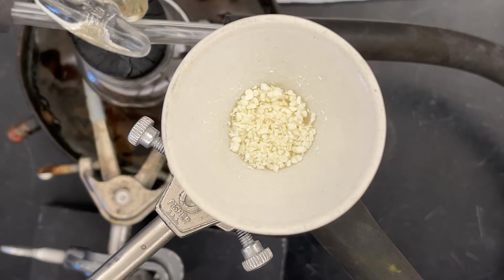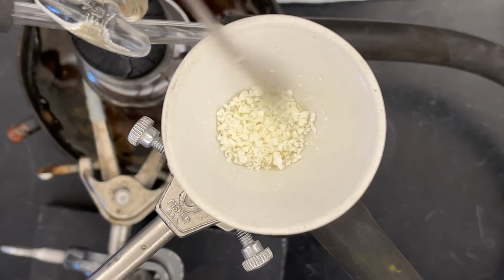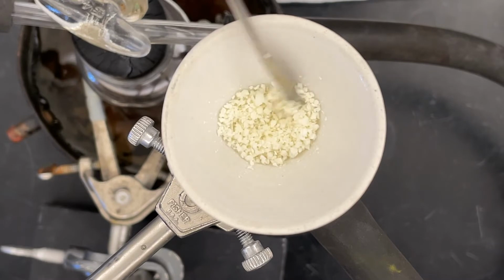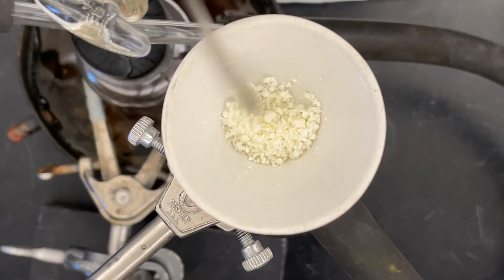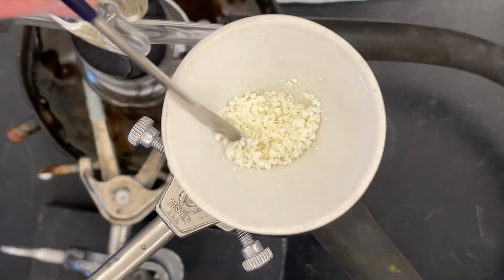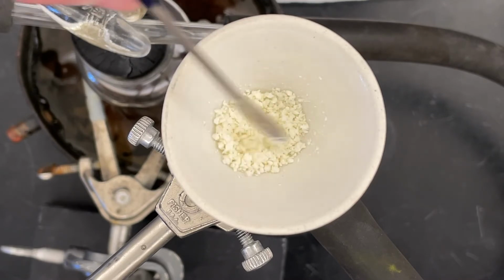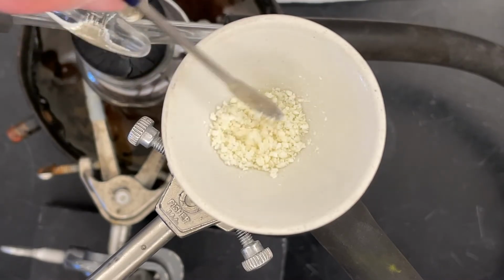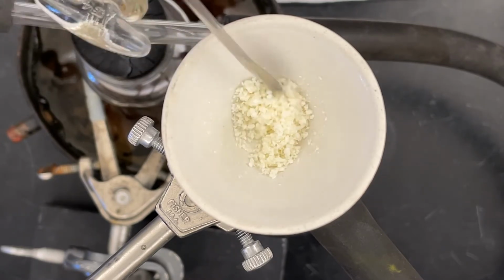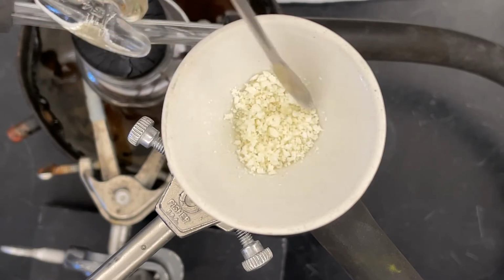Okay, one more shot while this is still on the filter. How do I know that this material is ready to come off? Good question. So we just rinsed it with water, and as we've said before, water is super sticky. I think you can see now that the material, as I've been working it a little bit on the filter, being careful not to disrupt the filter pad itself, the piece of paper that's in there. What I'm doing is just chopping it up finely, trying to give it as much surface area as I can. And you can see that it's really starting to move more freely without getting stuck or clumping. That's when I know that it's about ready to take off the filter.